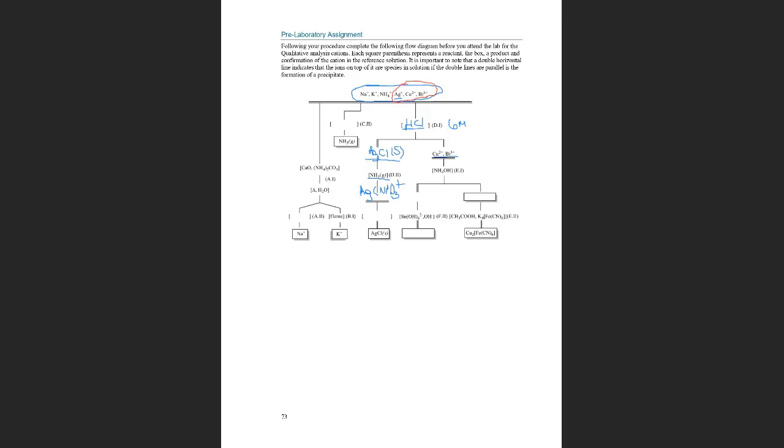So this is what we obtain when we dissolve the white precipitate of silver chloride with ammonia. And then we want to confirm. So what do we do? We add an acid. When you read the procedure, you will see you use nitric acid, and you come back with the precipitate.